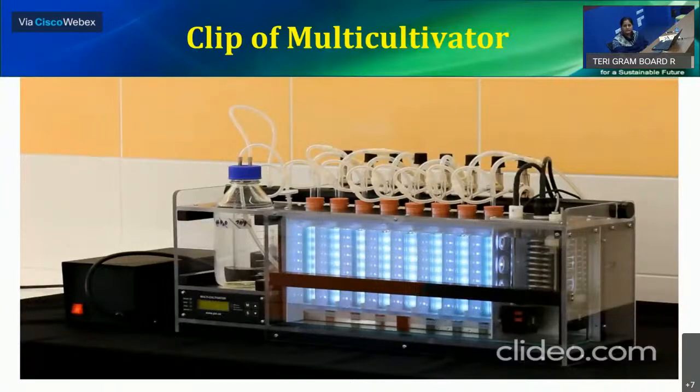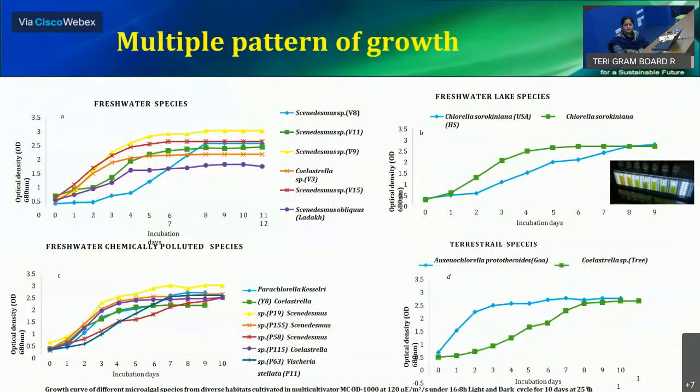We cultivate the algae in this mini photobioreactor, which contains 8 growth panels. This instrument also helps in generating real-time data of the optical density at 680 nanometer. So we extract those data from this multicultivator, and after that we can see the multiple patterns of growth.